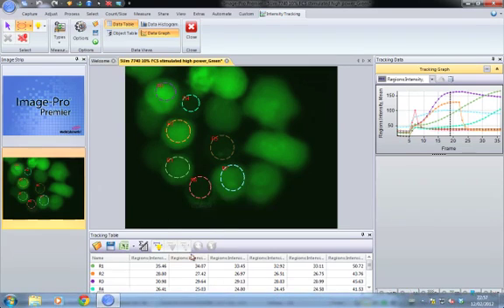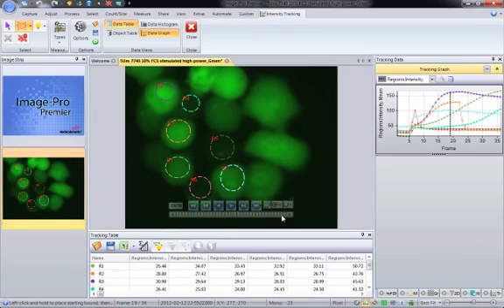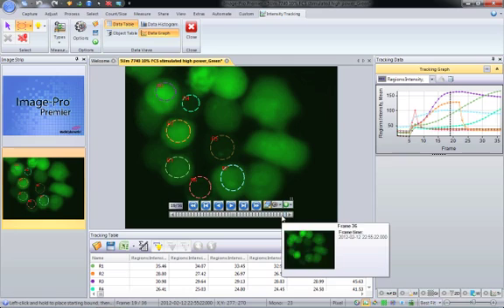It also shows up in the data table here at the bottom, where I can save it as I need.